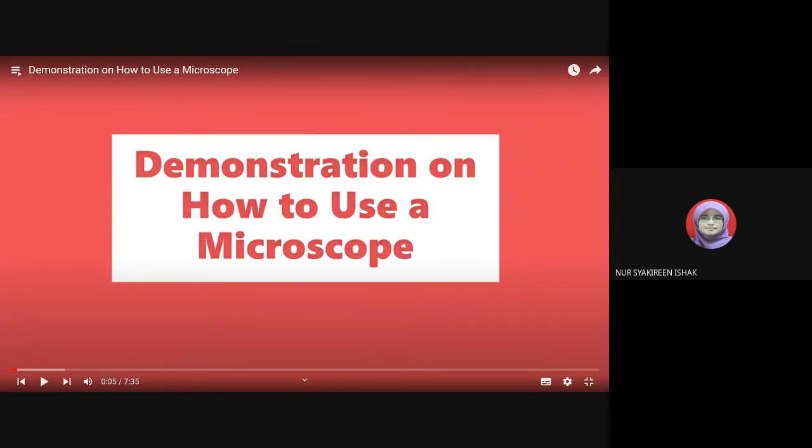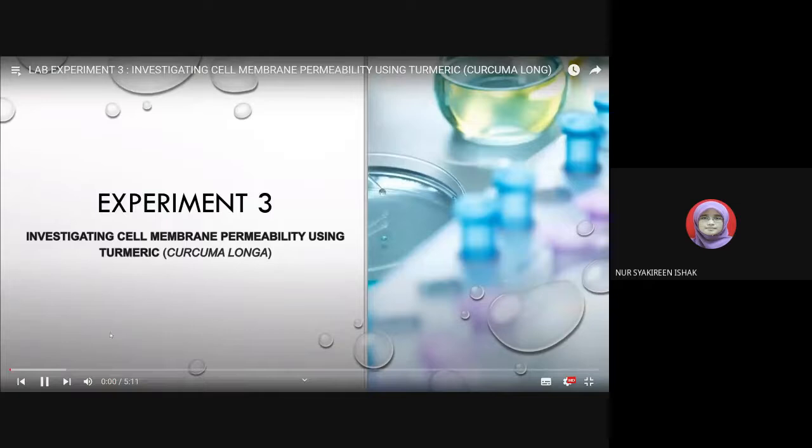Okay, so that's the demonstration video of experiment 3. So basically, if we look at experiment 3, how do you go back? Okay. Experiment 3, investigating cell membrane permeability using turmeric.